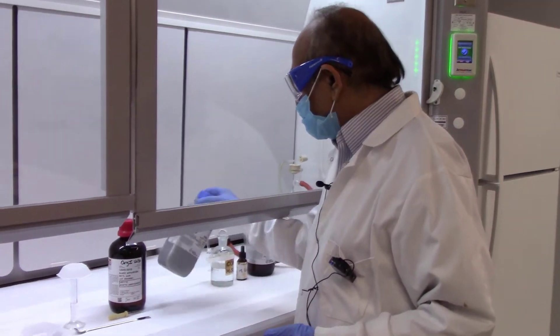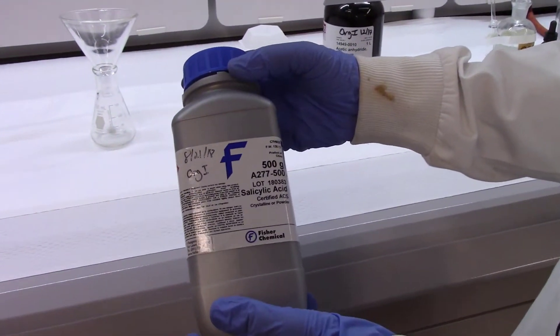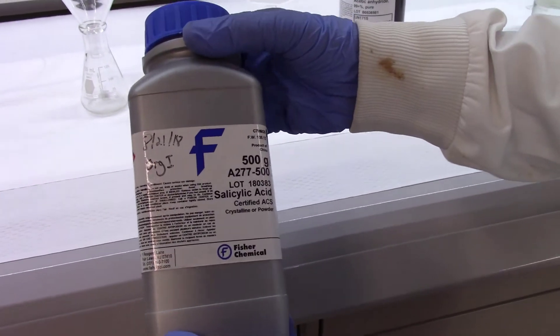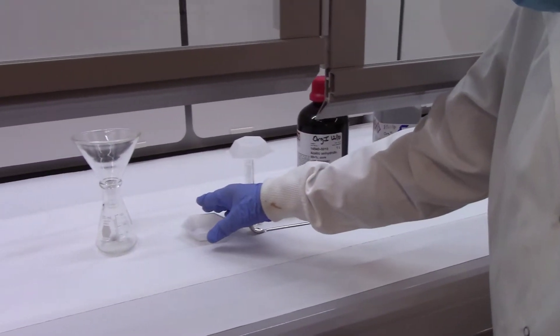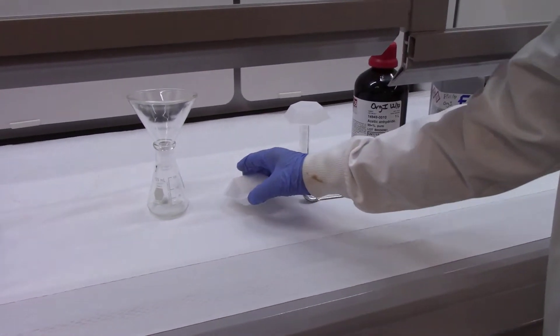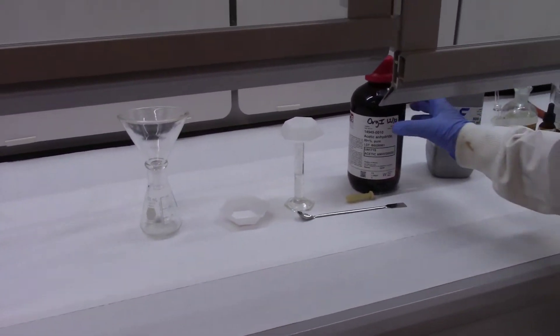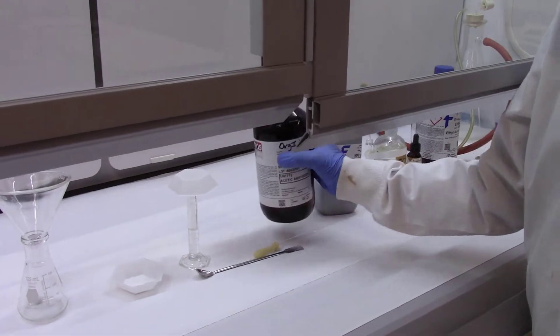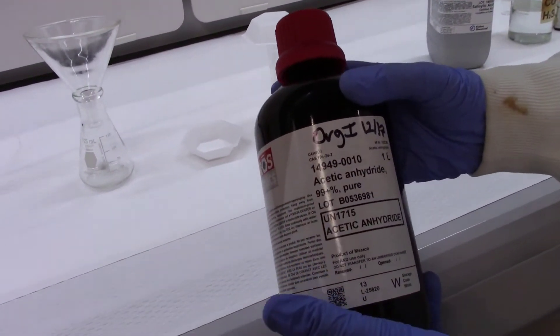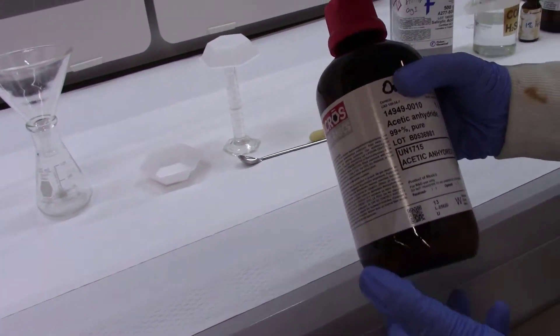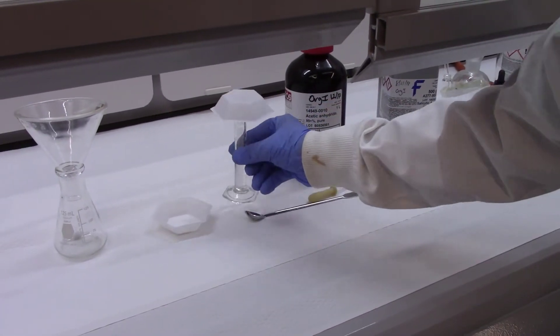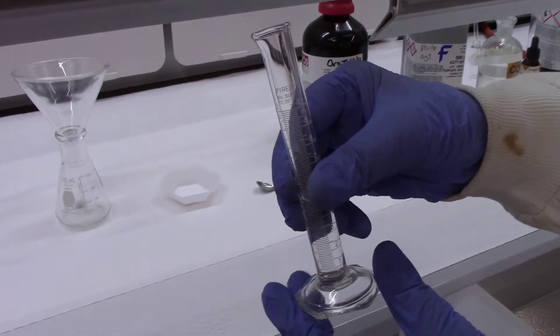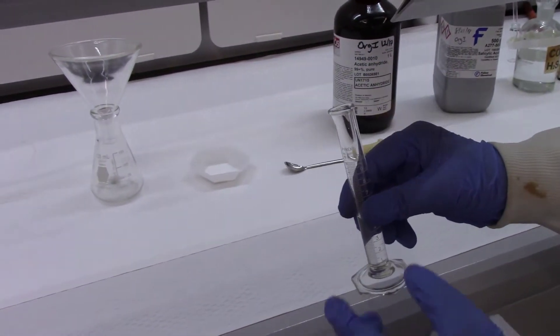Let me introduce to you the chemicals we'll be using, the reactants. This is salicylic acid, a natural product that will be used as a nucleophile. I have weighed two grams of this powder. And this one is the electrophile, acetic anhydride. I have measured five milliliters of acetic anhydride.